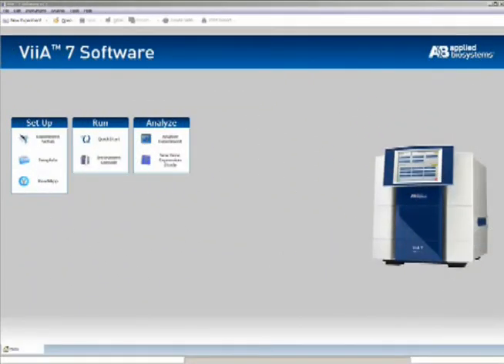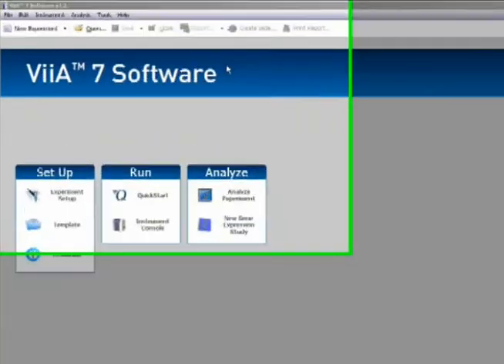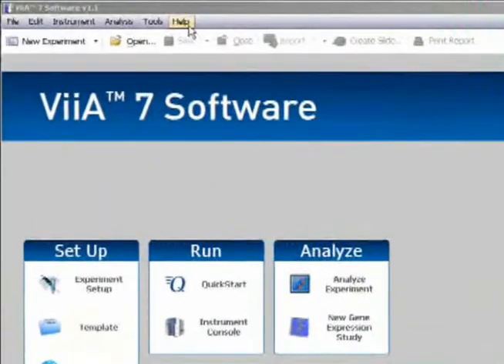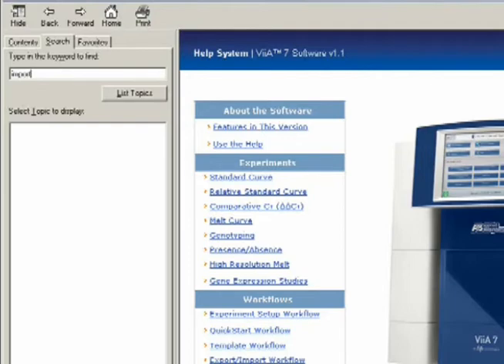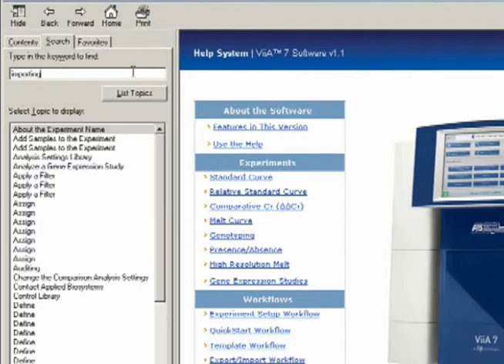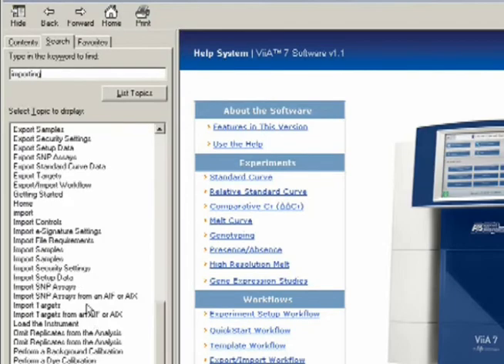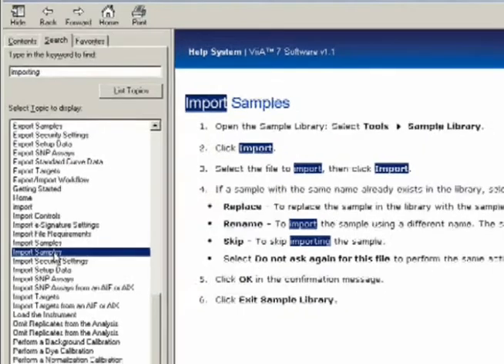Believe it or not, there are even more setup options that I didn't cover in these videos, including importing entire assay or sample name lists. To learn more about these techniques, just go to Help, ViiA 7 Help, and do a search for the word Importing. Double click on any item that you want to learn more about.